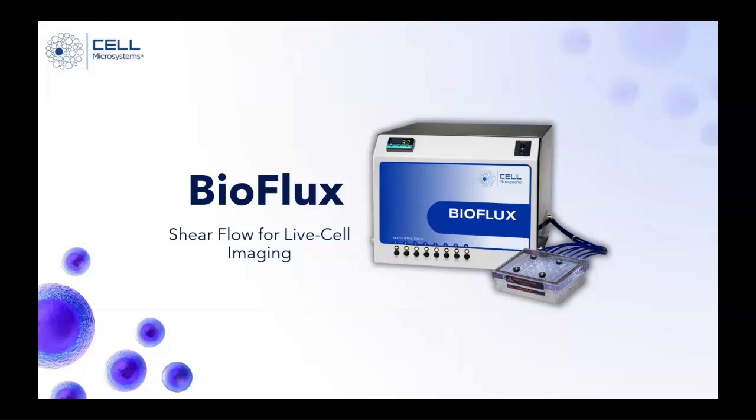Okay. Can you comment on possible usage of bacteria and erythrocytes with this system? So I guess I would need a bit more information, but both bacteria and erythrocytes are small enough to flow through the microfluidic channels of the BioFlux plates. It would just be a matter of understanding what the application is. Having said that, the BioFlux has been used to look at host pathogen interactions.